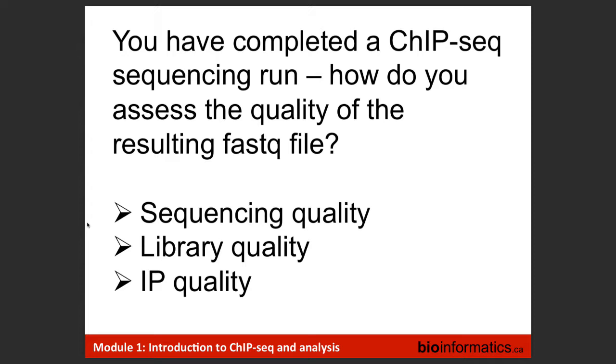I'm a little bit over time. So we'll talk about sequencing quality, library quality, and IP quality as we go into module one.